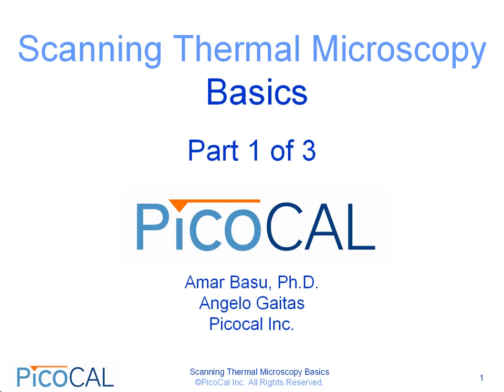Welcome to Scanning Thermal Microscopy Basics. In this three-part presentation, you will learn about an exciting new measurement technique used for the thermal characterization of samples at the nanoscale. The first part of this presentation will cover the basic concepts and principles behind thermal microscopy.